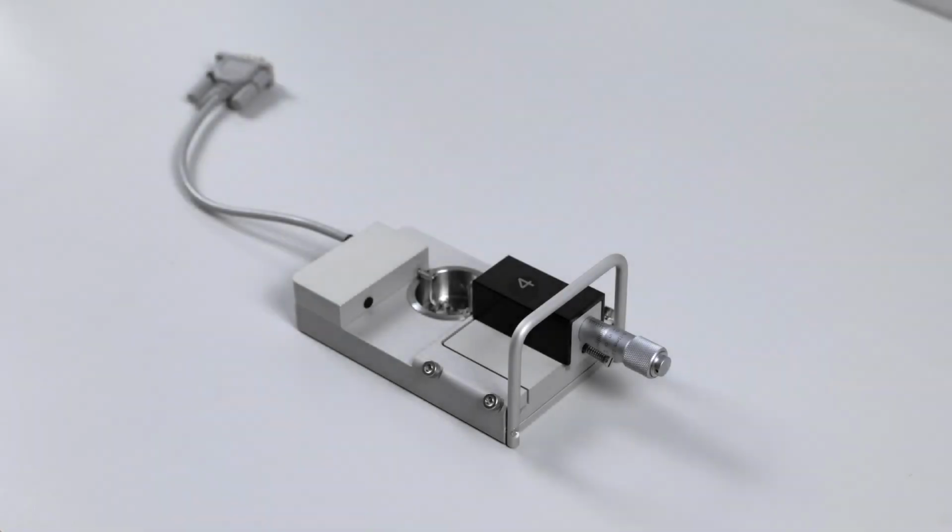This how-to video will show the process for taking a measurement of the reading using the micrometer. This is important when completing the normalization process or taking a length measurement of the stretch applied to your tissues.